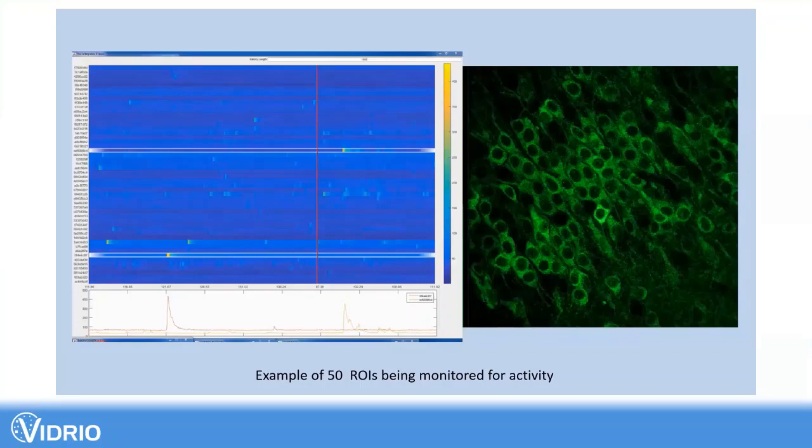Yeah, go. So when you generate holograms, what type of algorithm are you using? Because in general, these algorithms are very time consuming, especially as the number of points that you want to modulate increases, as Nico showed in the first day. So what is your approach here to generate these holograms?